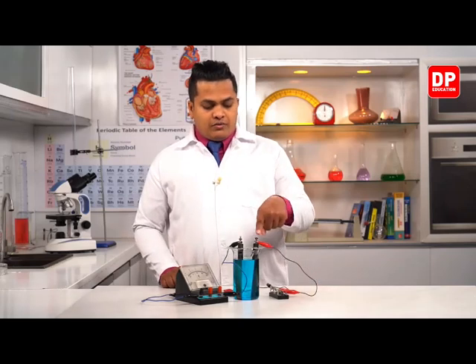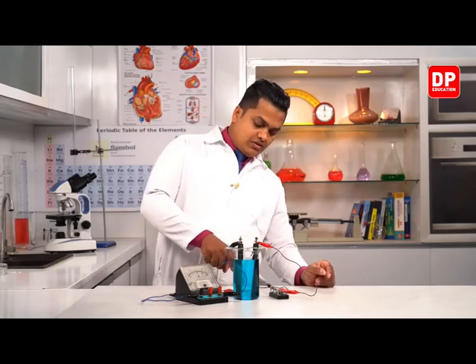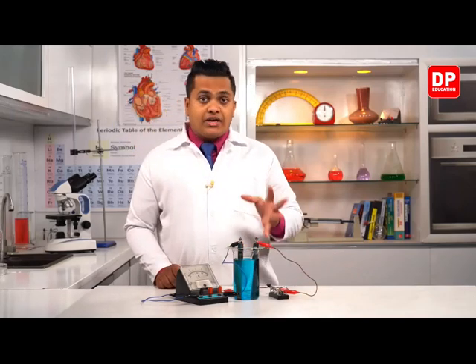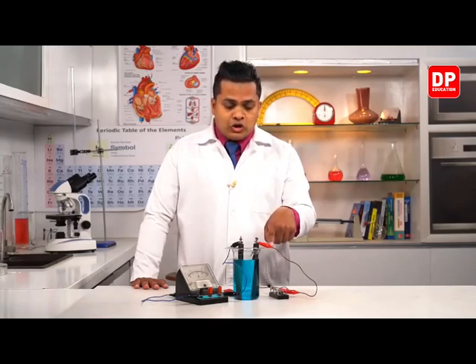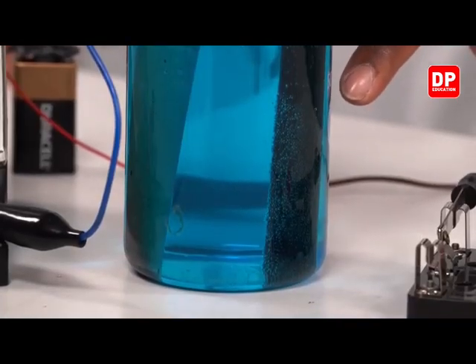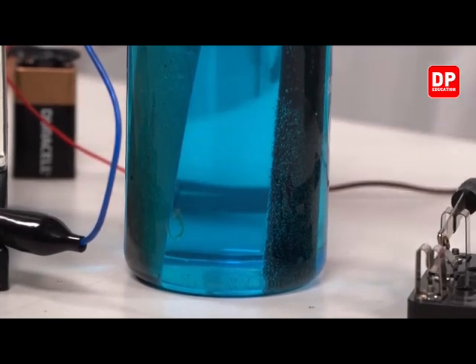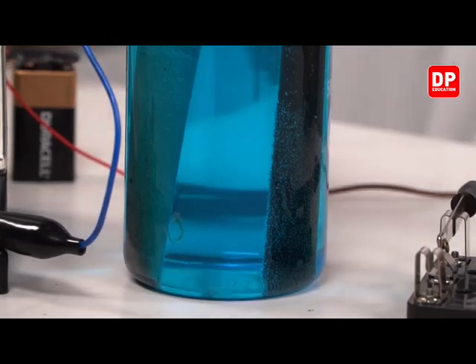So we'll check the terminals. There is no such difference at the negative terminal, but however we have to take it out and observe. However, my dear children, within the solution, this is the red color terminal. The red color terminal is the positive terminal, right? So the positive terminal is emitting gas bubbles. See, it's emitting gas bubbles. So let's keep the system for a while.